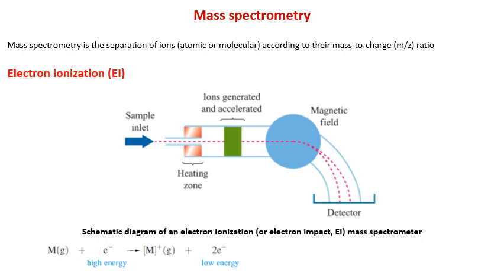In the mass spectrum, the signal intensity is plotted in terms of relative values, with the most intense peak, called the base peak, being arbitrarily assigned a value of 100%. So in the next couple of slides, I will show you in the mass spectrum the most intense peak, which is 100% abundance. It is called the base peak. It may or may not be your molecular ion peak, but it is arbitrarily called the base peak.